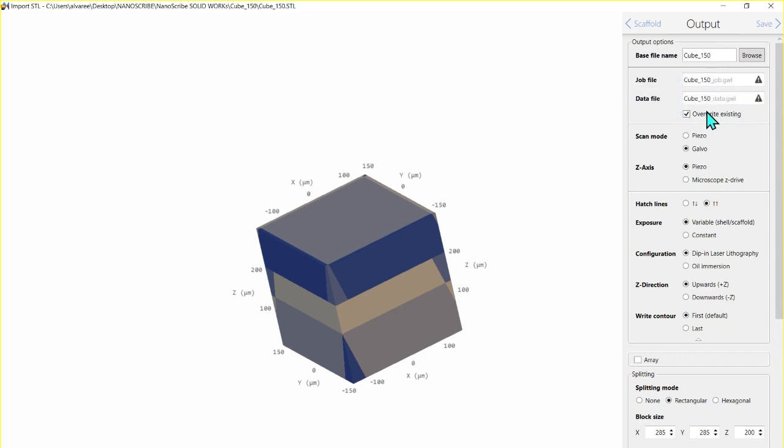And you cannot change the name, because if you change the name and it's not coincident, NanoScribe cannot print. Okay? So that's why I say to the users, please just create one folder for each structure and keep there all the files that DeScribe is creating. Okay? Because it's going to create these two and even more that we don't see in here.